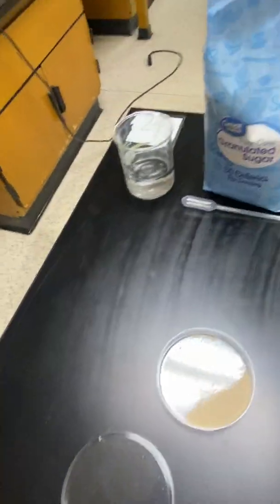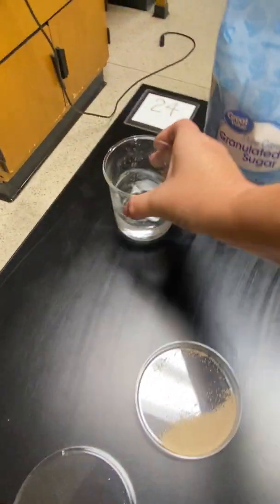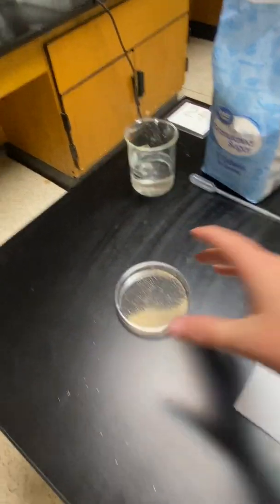What happened was we put a scoopful of just sugar, we poured a little bit of warm water in here, we put the lid on, and we waited 24 hours. And I'll show you the results.